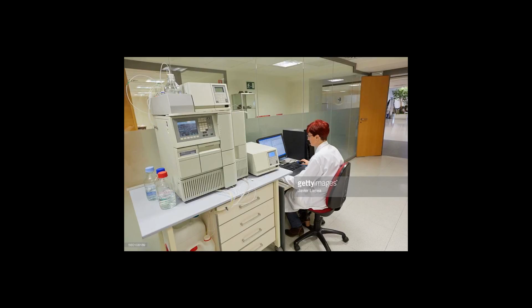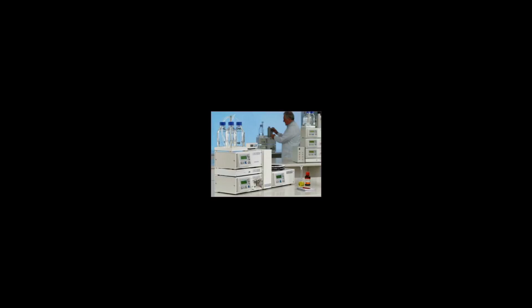THF, or isopropanol. In isocratic elution, peak width increases with retention time linearly according to the equation for N, the number of theoretical plates. This leads to the disadvantage that late eluting peaks get very flat and broad. Their shape and width may keep them from being recognized as peaks.